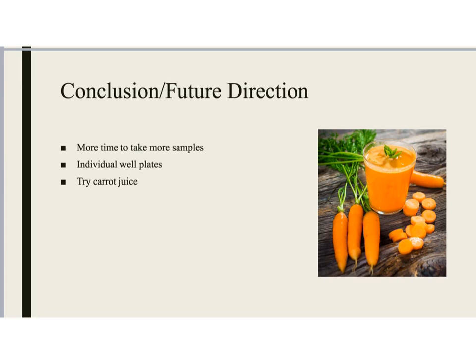Also, I would like individual well plates because we used the well plates as a class. People might have been able to put their treatment into my well on accident, causing me to have greater significance and greater apoptosis than maybe what my actual extract would have been.